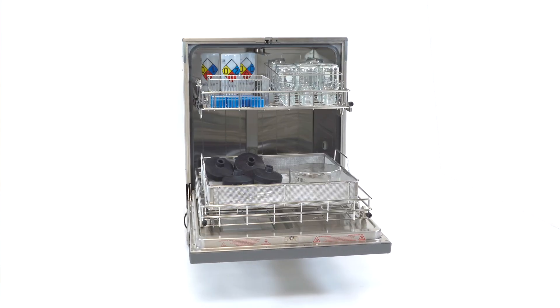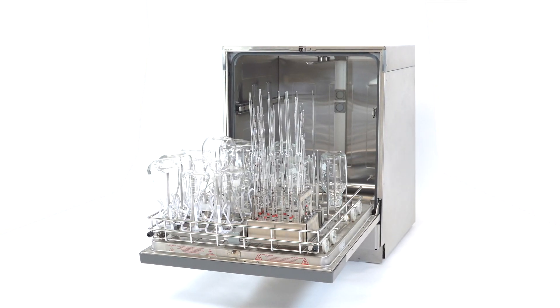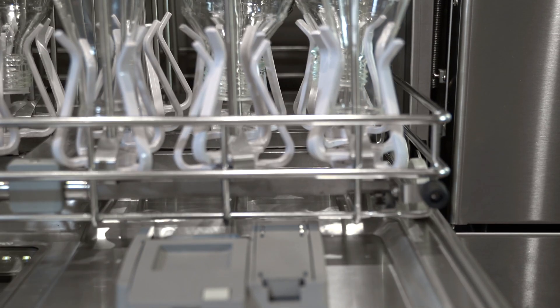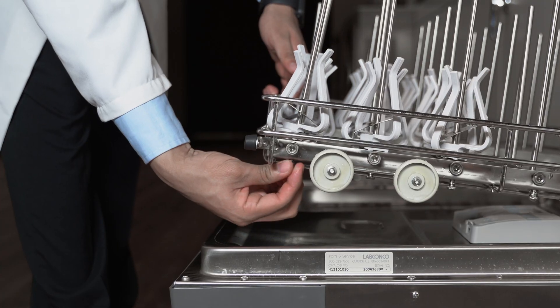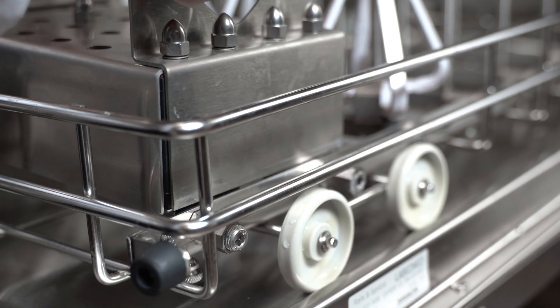More than 5,000 different configurations of labware consistently clean and dry every day, every run. LabConco Steam Scrubber and Flask Scrubber glassware washers have a variety of unique features to get washing right every time for every type of labware. Inserts can be easily changed to suit the diverse types of labware your lab uses.